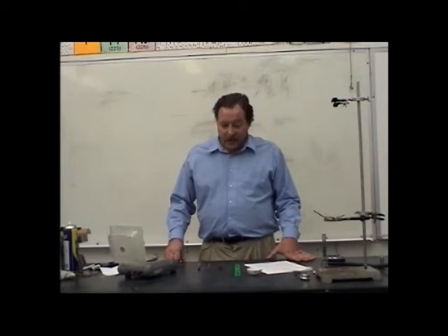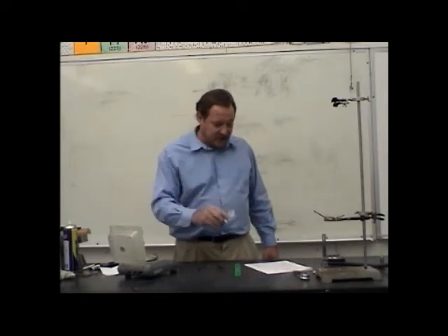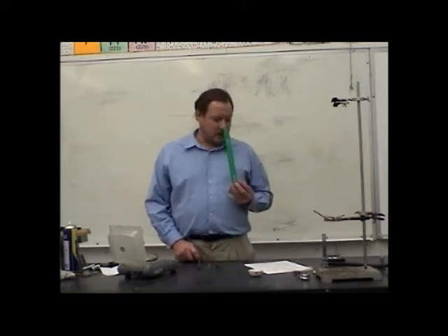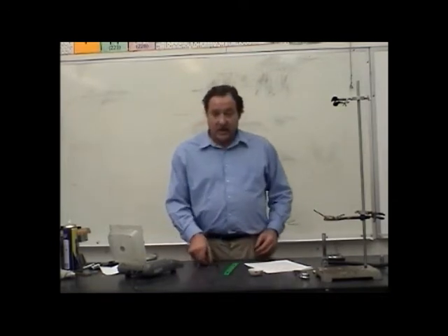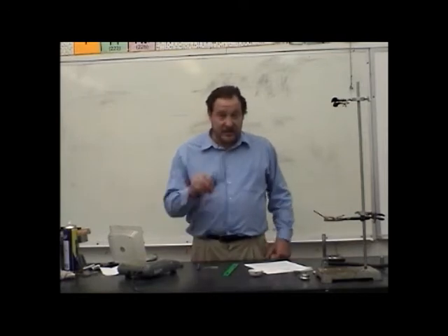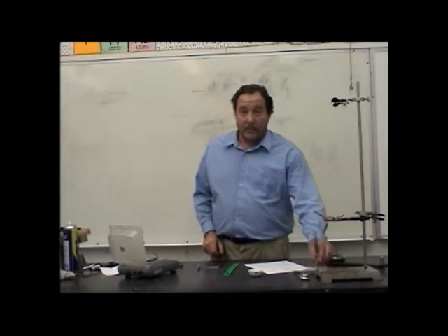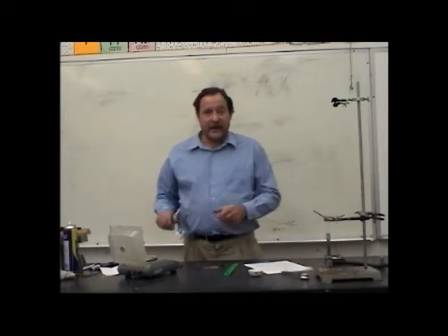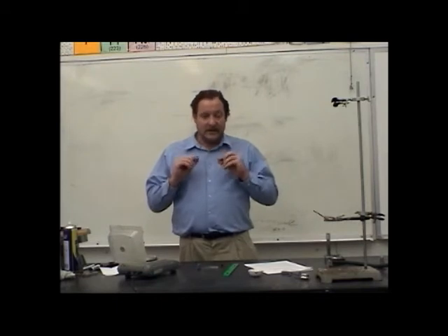For this experiment, we're going to need an evaporating dish, a balance, a ruler, a strip of magnesium, some forceps, a burner and a striker, and don't forget our safety glasses.